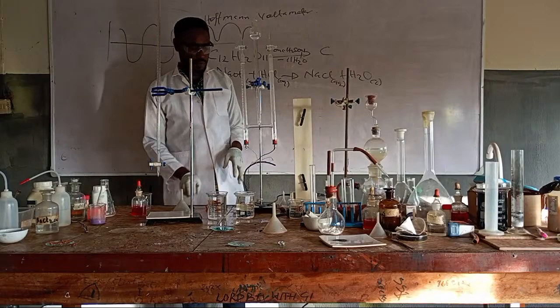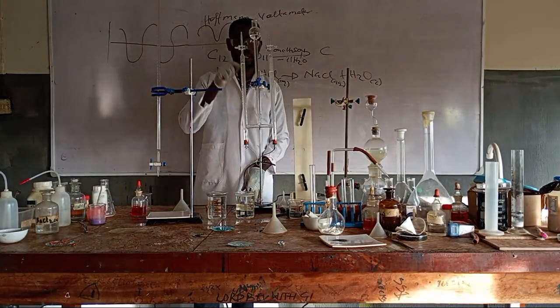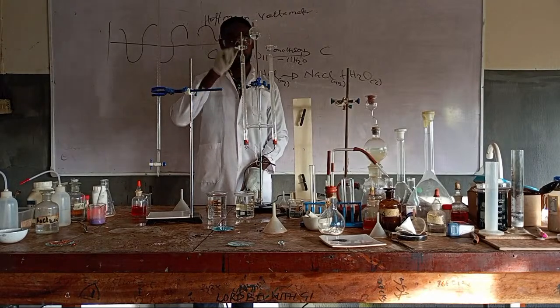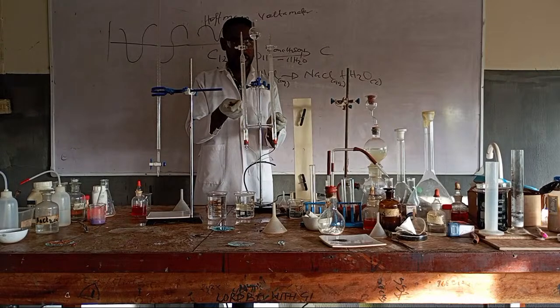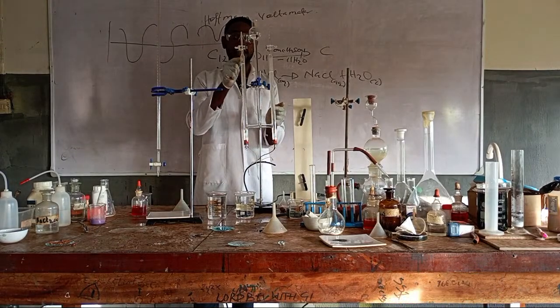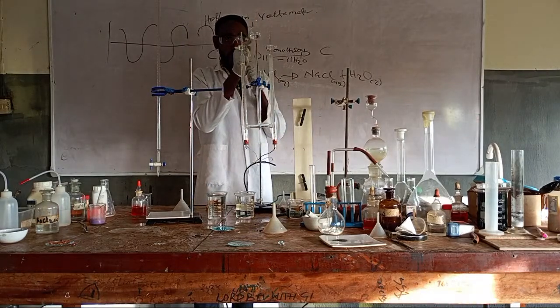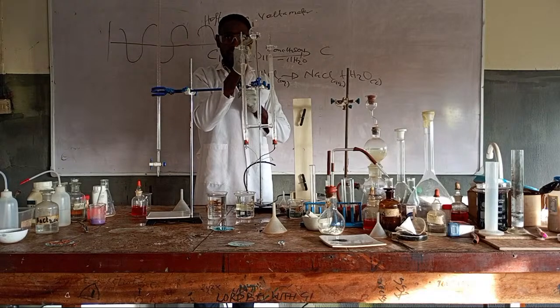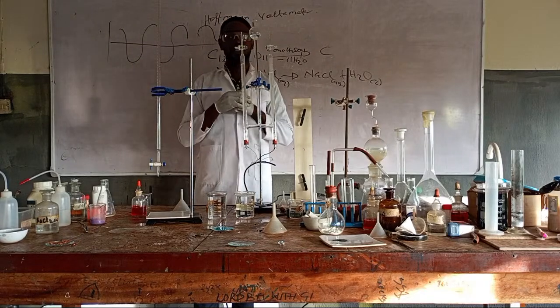Am I communicating? You have seen today that you can electrolyze water. Gas is being evolved. There is effervescence occurring, right? The gas is occupying here, pushing the liquid down to come to this reservoir. Are you not noticing that the level of water in the reservoir is rising? This water falling is entering here.